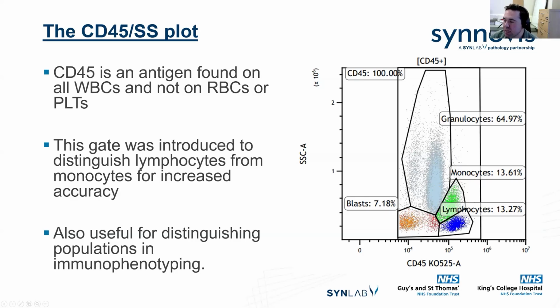These are your lymphocytes. Next up, and remember the side scatter was an indication of how the internal complexity of the cell looked. So just slightly higher up on that, we have monocytes. And then again, as with the plot we showed a while ago, the granulocytes show quite a lot of internal complexity, and they're high on the side scatter.